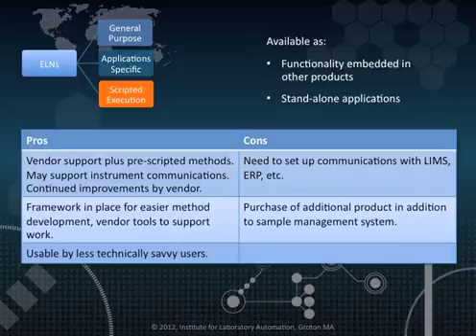A downside, unless the vendor supports it, is a need to arrange for communication support with a LIMS or enterprise resource planning system. Depending on your requirements, this most likely will involve additional programming. You'll also have to purchase additional software to complete scripted execution and sample management, since you're dealing with two software packages.